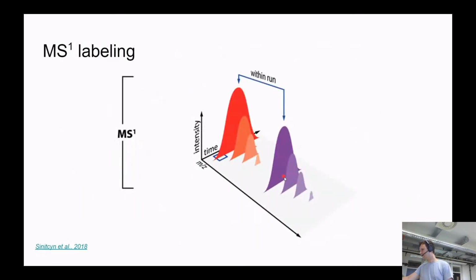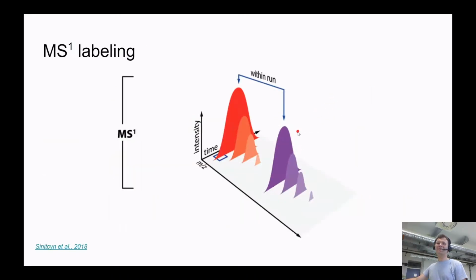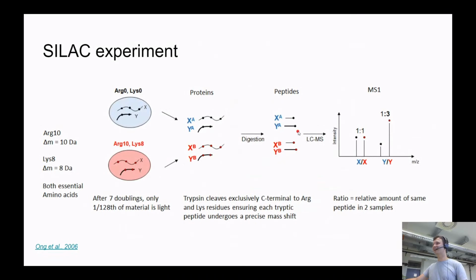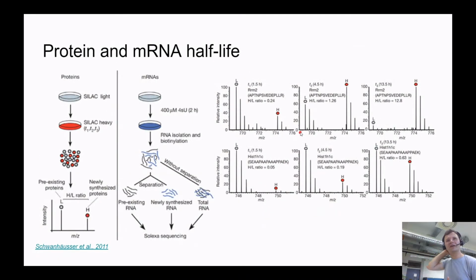Okay, cool. How can this SILAC experiment be used? Honestly, initially, as you can imagine, it was used as a very sensitive differential expression method. You can just treat one set of cells and keep another set as control, and measure and see which proteins actually change concentration. But there are some specific applications where the SILAC method is an incredibly powerful technique. One of them is half-life measurement.